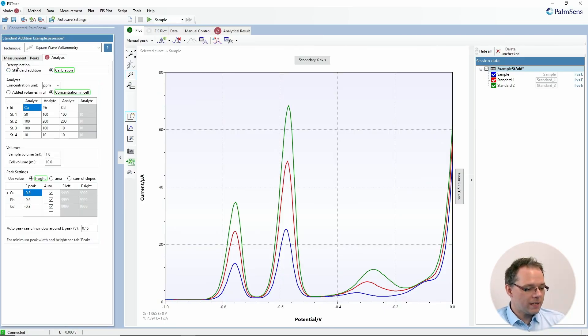The other option is the standard addition, which is also very popular in analytical chemistry, especially for complex media. For example, you take a river water sample and you want to determine the heavy metals. How you would do that is: you first measure just your river water sample, then you add a known amount of a standard solution of the metal ions you're interested in, you measure again, you add more standard, you measure again, and so on. From that you can calculate the original concentration in your solution.